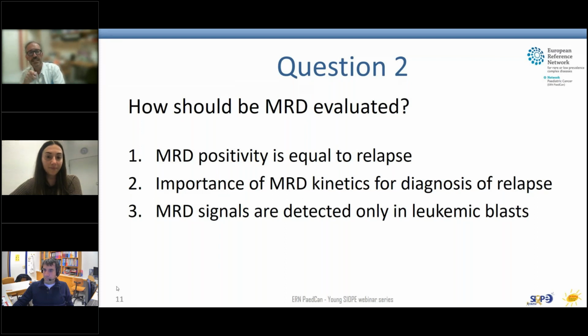Yeah. This is a real rare situation where you find this MLL rearrangement in T cells. This is the unusual of the unusual situation.